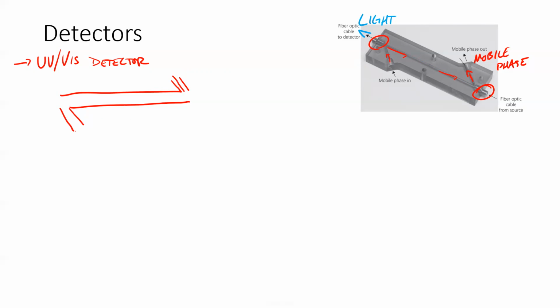So again, our mobile phase is coming in and leaves. On each side of this container, this detector, you've got some quartz windows. Right?